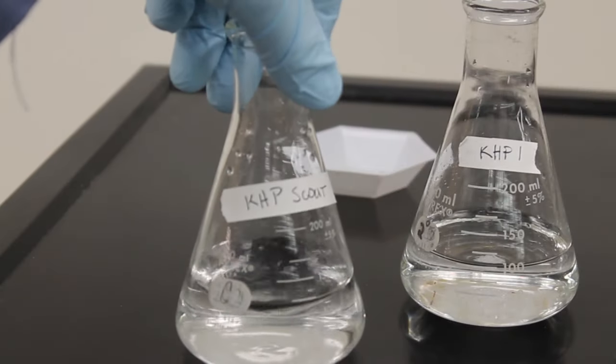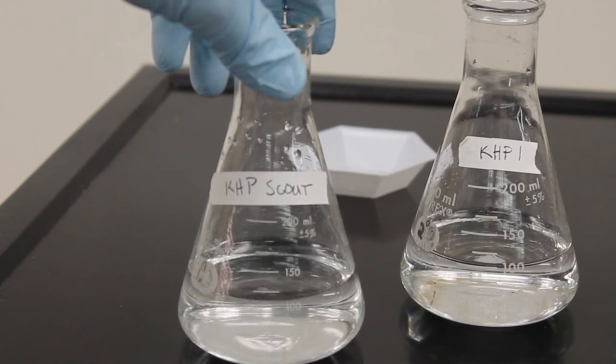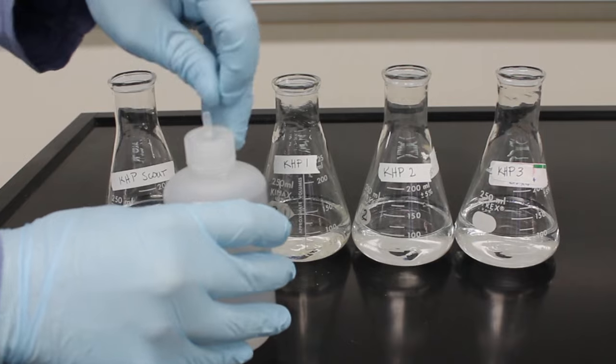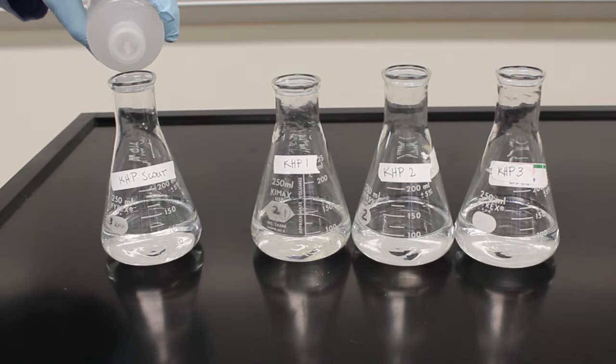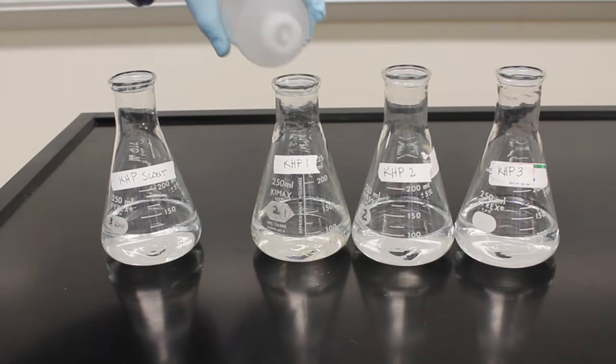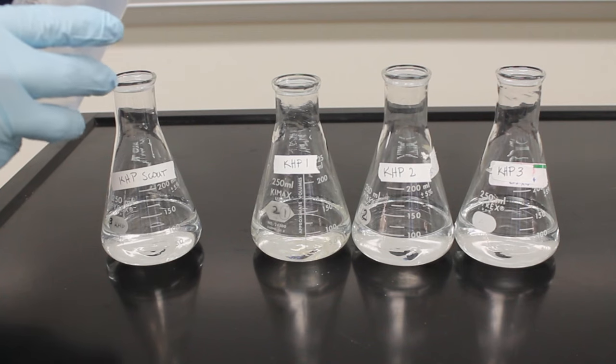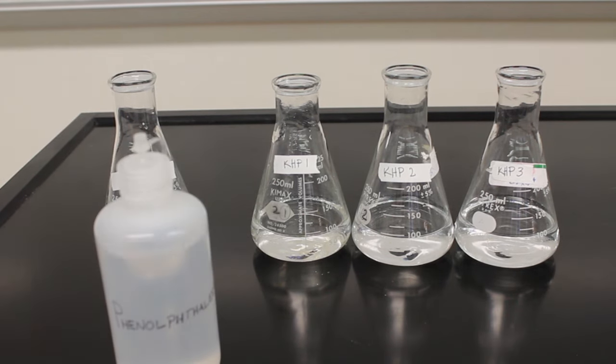Here I am doing 4 titrations. The first one is known as a scout titration. More on this in a bit. Next, add a few drops of phenolphthalein. 2 or 3 drops per flask will be sufficient. Now we are completely ready to start our titrations.